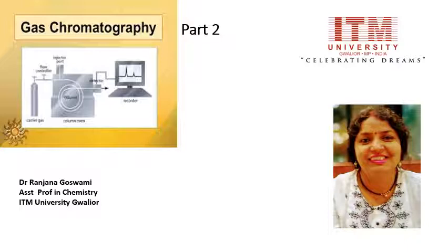We have discussed in part 1 the gas chromatography introduction, principle, types, and various components of the chromatography like carrier gas, injection port, column, and various types of the column. In this part, we move further.